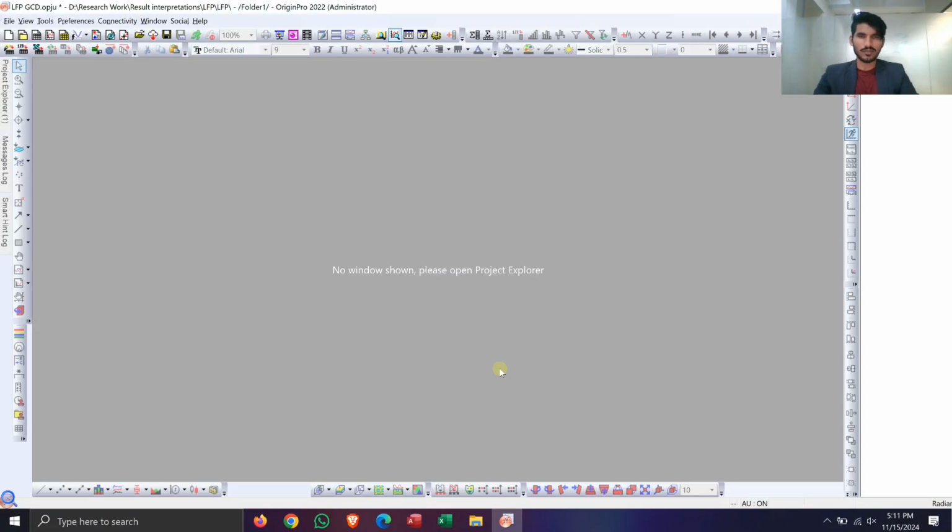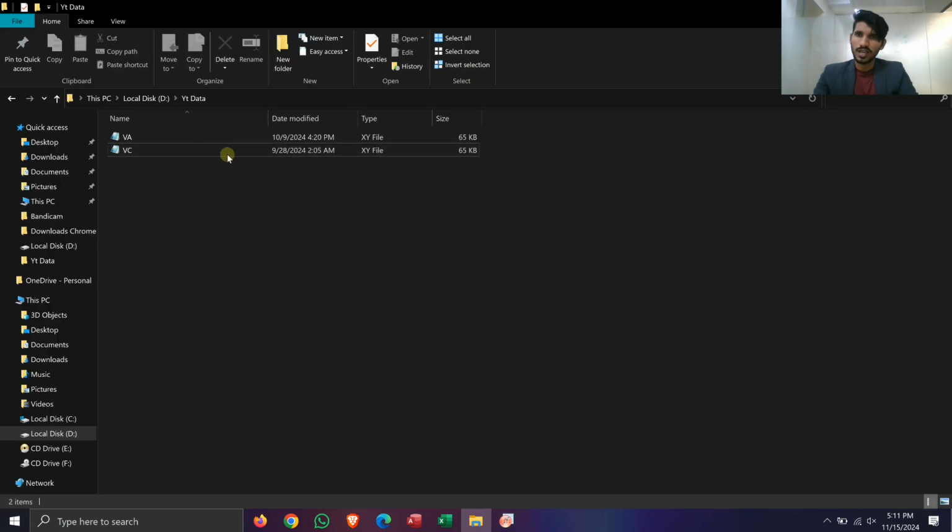Hello there. The topic of today's video lecture is how you can plot multiple XRD data on the same graph. So moving on, what I have here is two different XRD patterns.